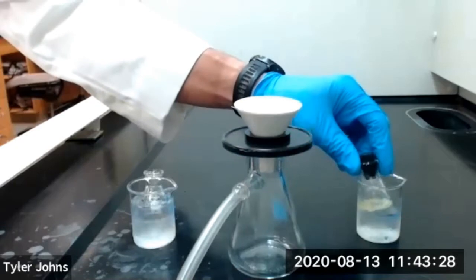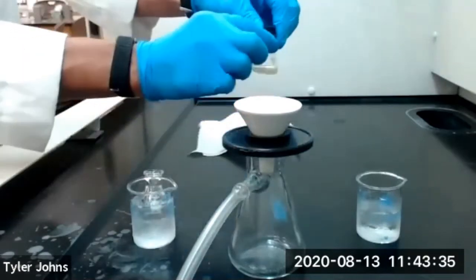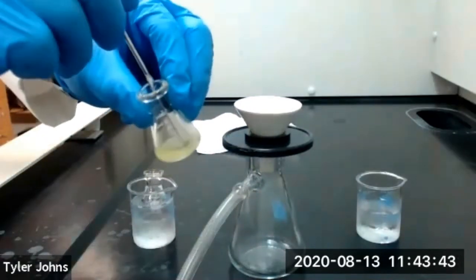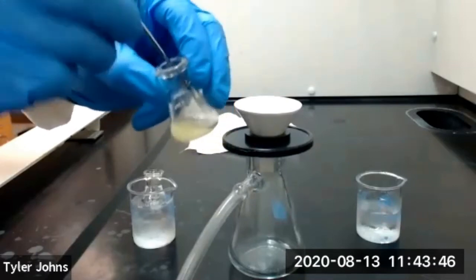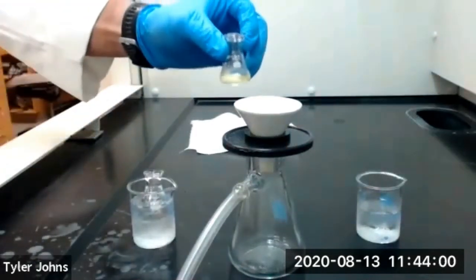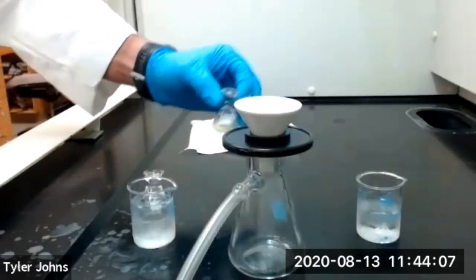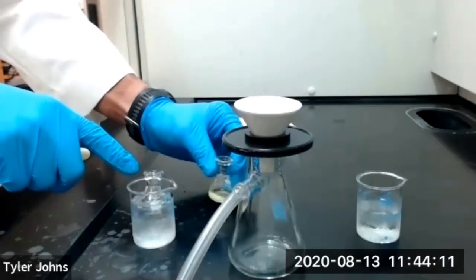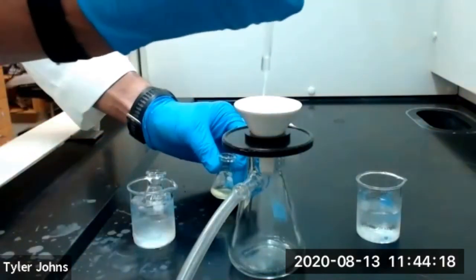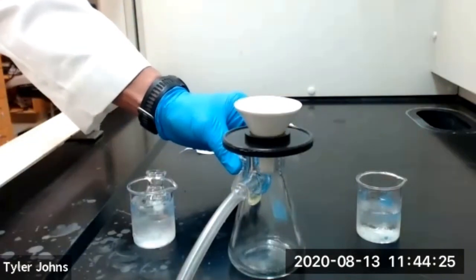We'll now remove our crystals in our 10-milliliter Erlenmeyer flask from the ice bath, dry our flask, remove the stopper, and use a micro spatula to dislodge those crystals from the bottom of our flask. We want to make sure we wet our filter paper in our Hirsch funnel with a few drops of ice-cold 95% ethanol, then turn on our vacuum.